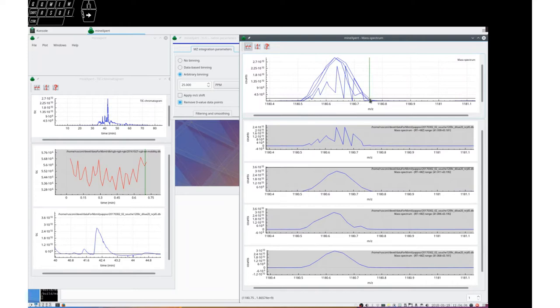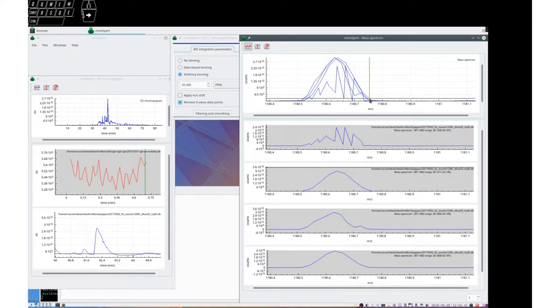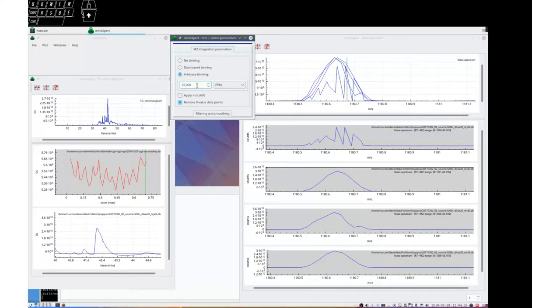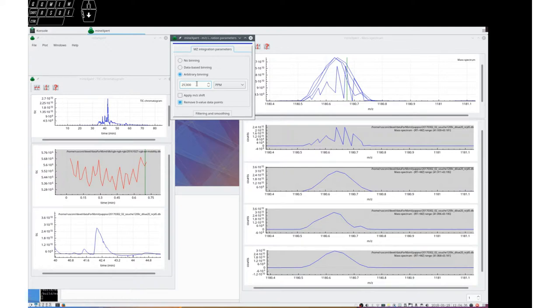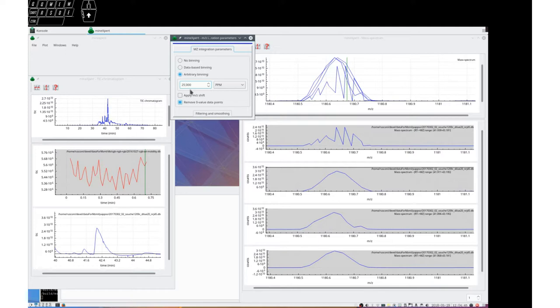It would take a long time and maybe I should look at the numerical values of a single spectrum to show you why this happens. Of course, in the proprietary vendor software, we don't need to configure this because the vendor knows how to write software to do the proper integrations. But for us to be able to integrate properly any data coming from any vendor, we decided that we would do this kind of configuration feature.